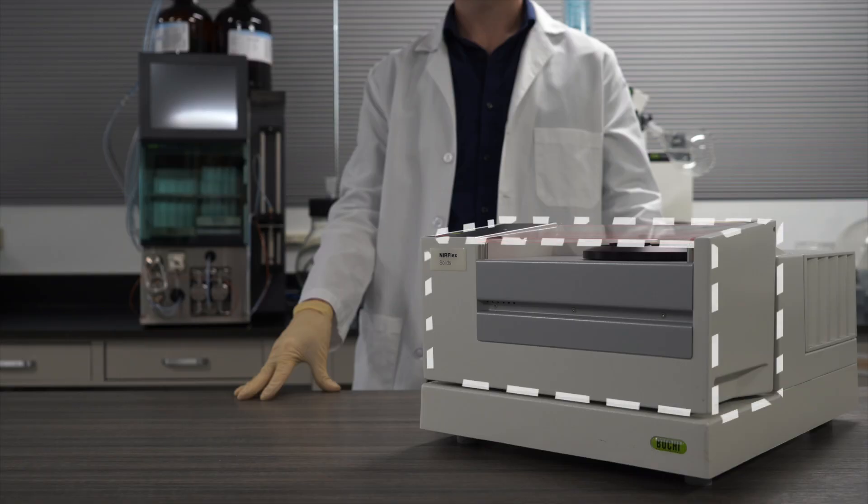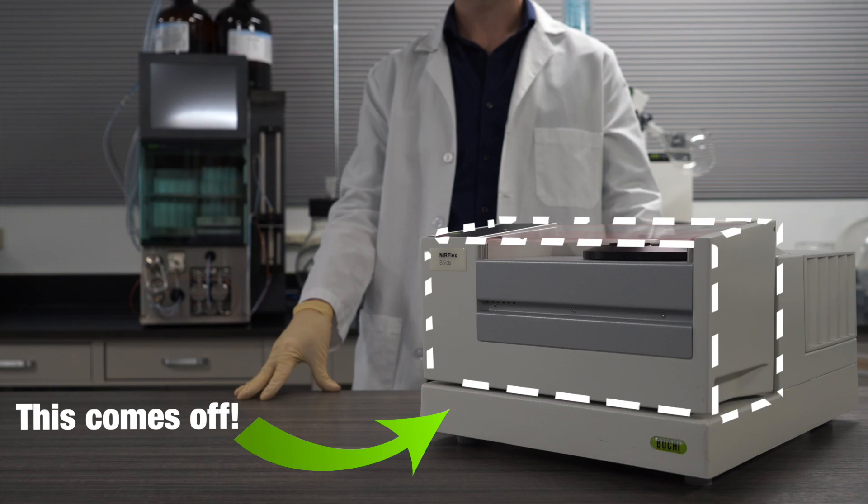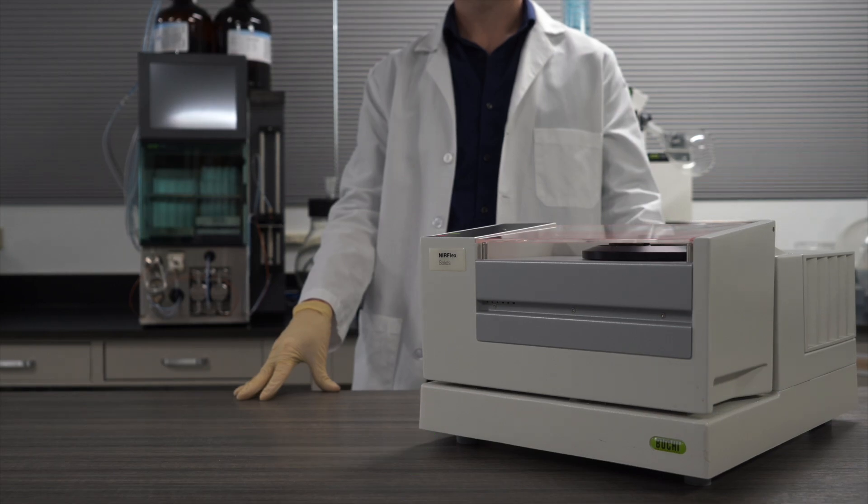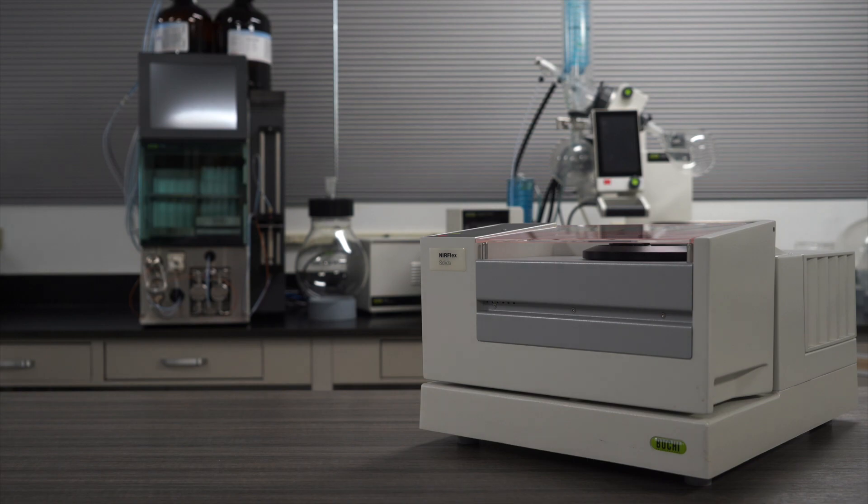The system has four plug-and-play sampling modules to choose from to best fit your application and optimize method accuracy. I'll give you a rundown of each one, starting with the solids module.